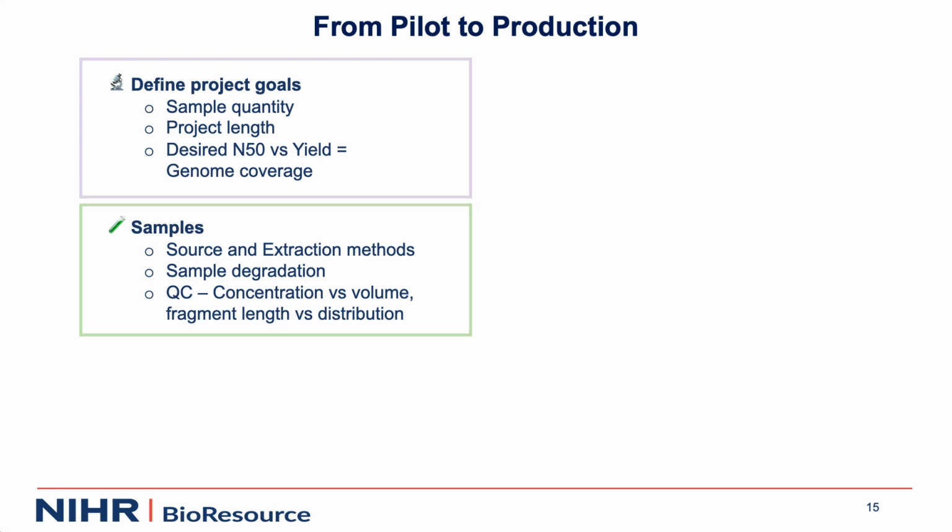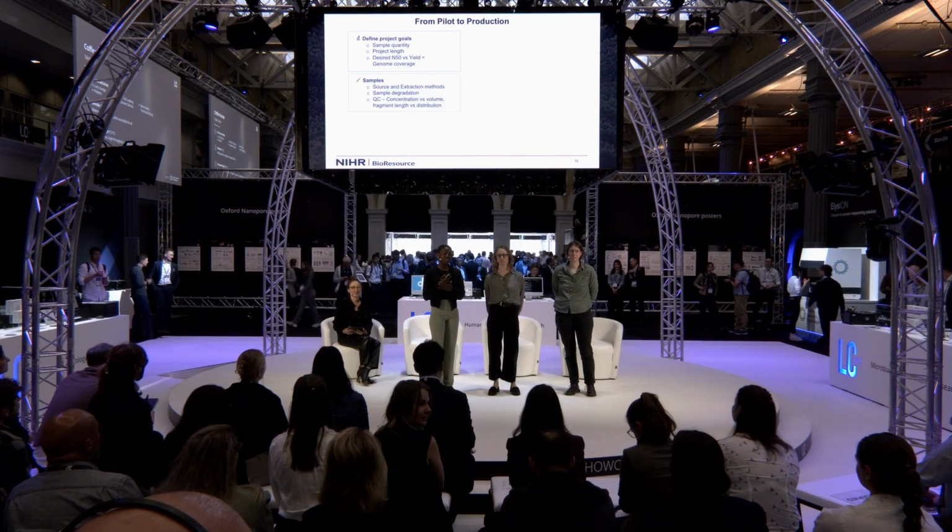It also had us tracking sample degradation, and we also made sure that we carried out thorough QC on our samples, as well as developing or using strategies to improve our fragment length and fragment distribution.